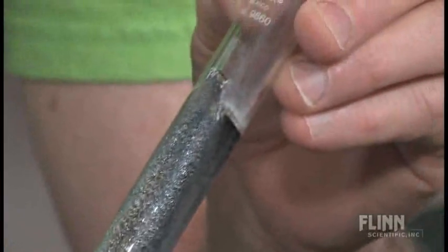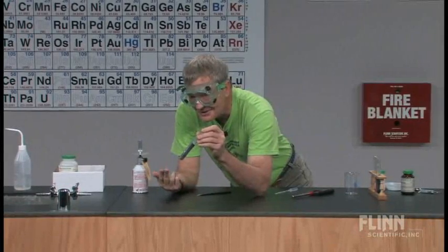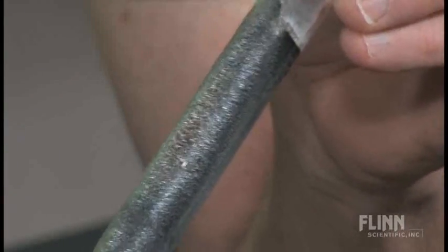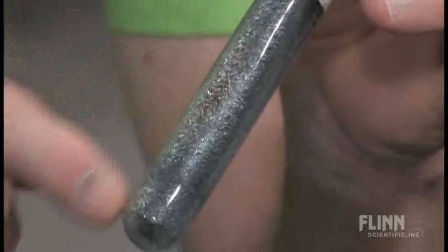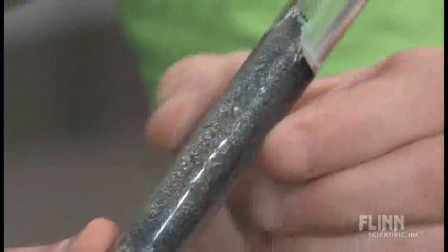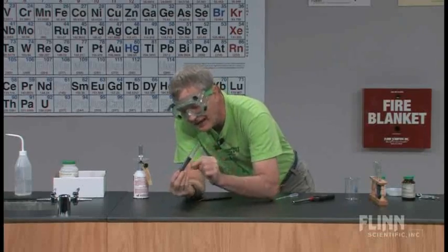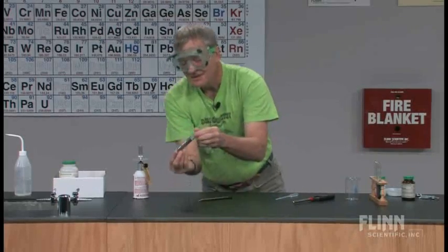Well, I said there were 3 things in there for it to react with. You know, the oxygen, the sand, but what's the test tube made out of? You know, glass is mostly silicon dioxide. So it's reacted with the test tube itself. And I've got silicon metal, or silicon metalloid, I guess, or semi-metal, whichever word your textbook uses. I've got silicon formed on the outside of the test tube all around it.